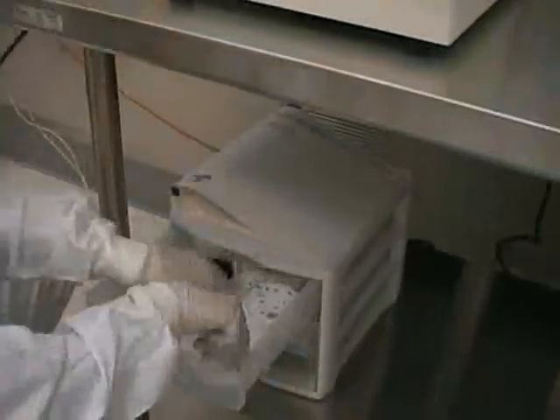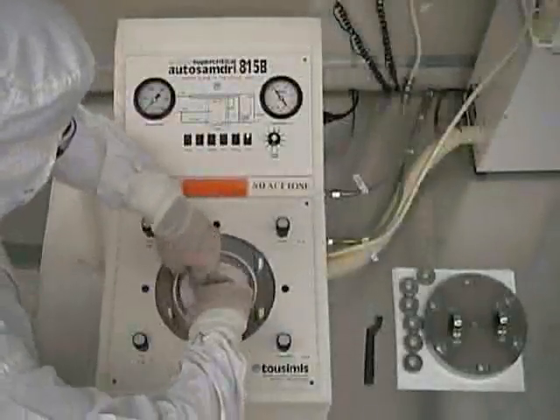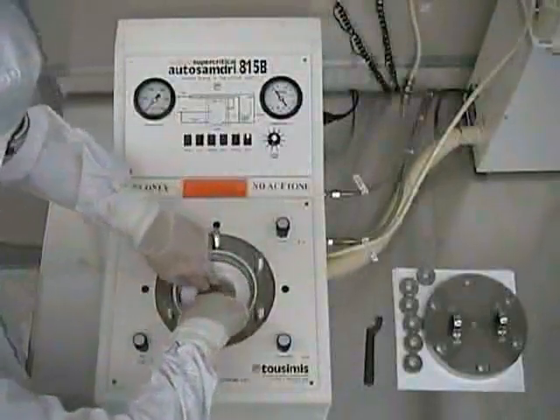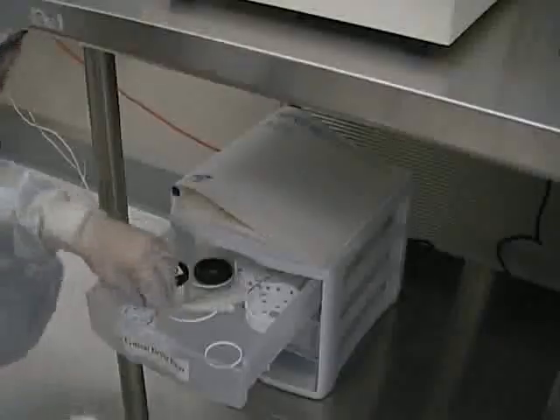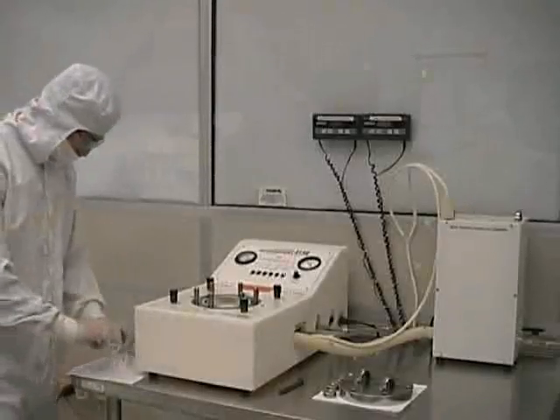If you plan on processing wafers three inches or less in diameter, make sure that you use the proper size chamber insert. This will keep your sample more stationary during processing. While the unit is still warming up, you should carefully and quickly transfer your wafers from your wafer container into the proper size wafer holder.